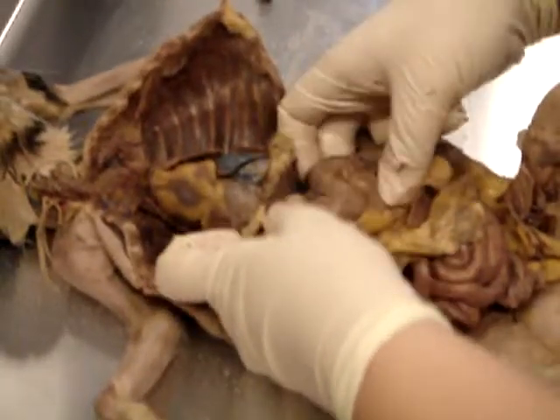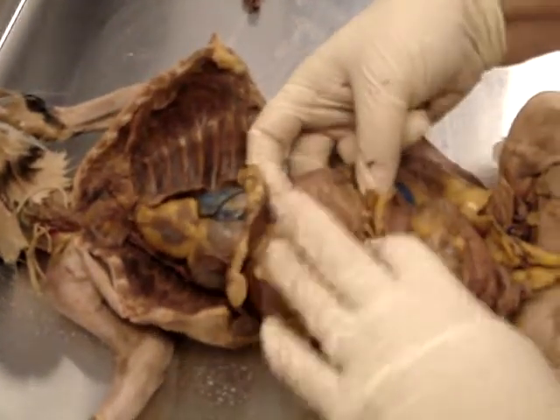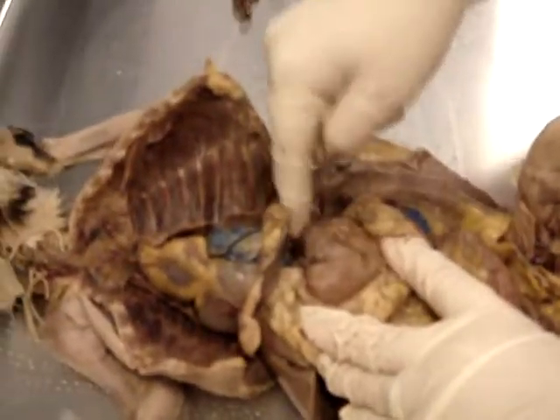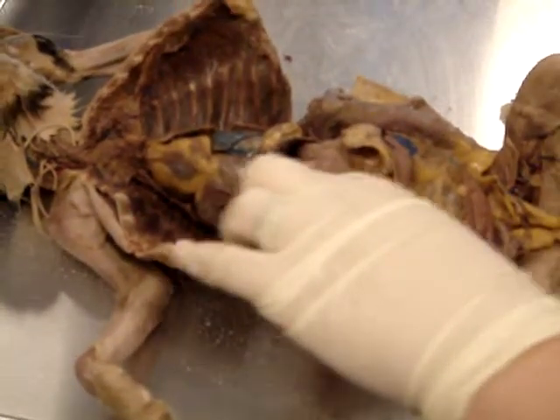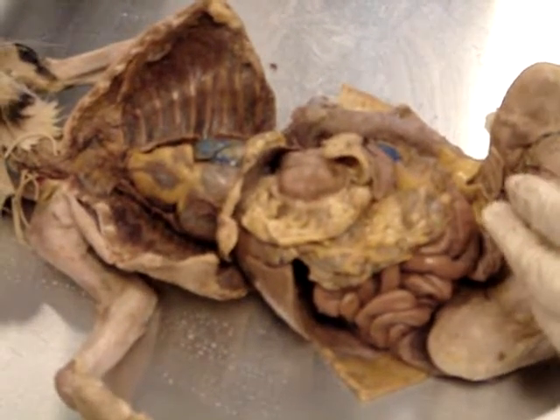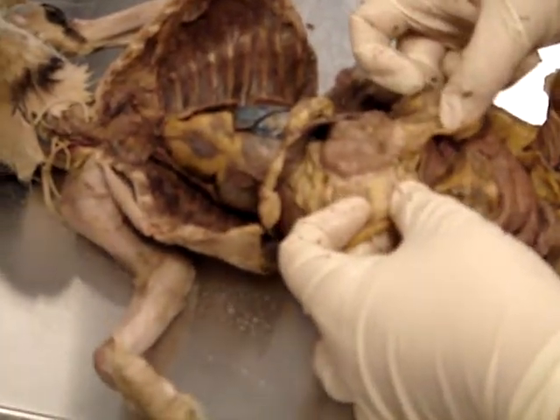Okay, so up here is the stomach. And the stomach is kind of J-shaped. Well, he's a little cat, right? So here's our stomach, and it's kind of J-shaped. And because it's curved, we have the outer curvature and the inner curvature. And this outer curvature is called the greater curvature, and that's what the greater omentum is stuck to.